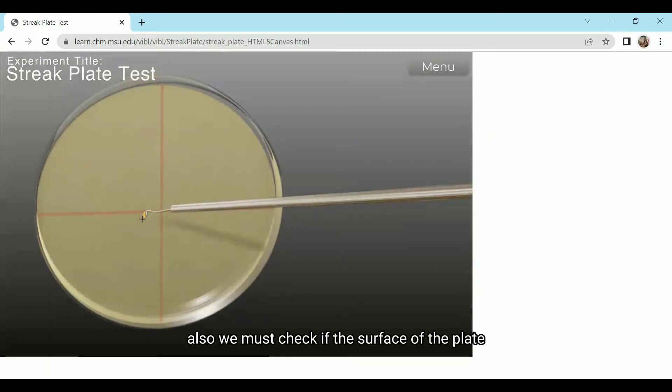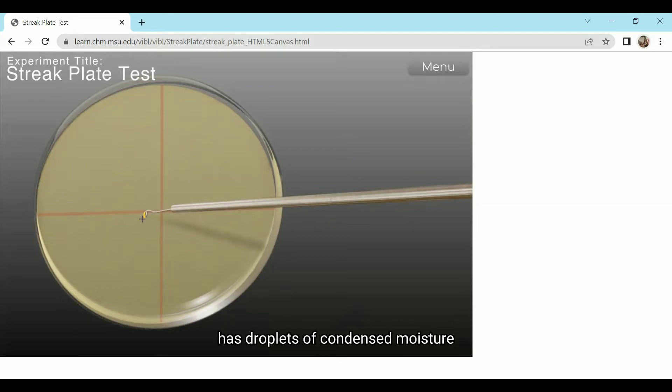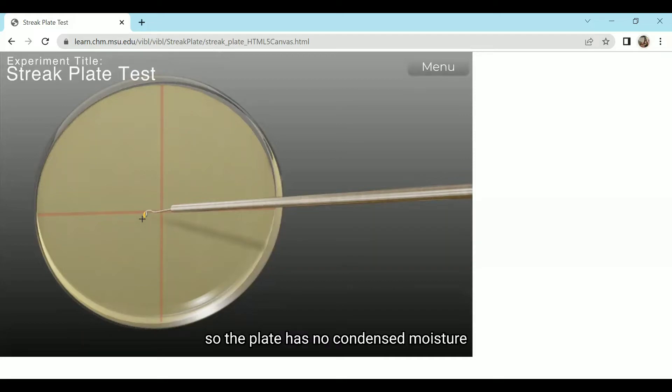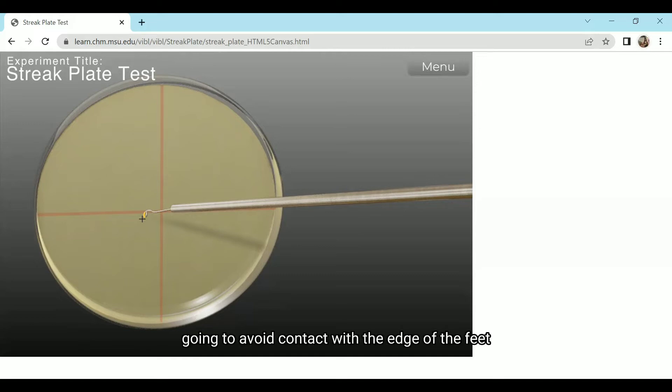Also, we must check if the surface of the plate has droplets of condensed moisture because this can affect the accuracy of our experiment. So, the plate has no condensed moisture. We are also going to avoid contact with the edge of the plate because this can introduce contaminants to the agar.